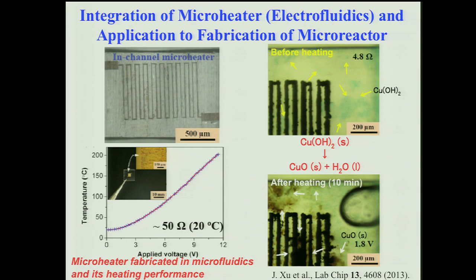Then this technique was applied to fabricate a micro reactor by integrating the microheater into the glass microfluidics like this. And this integrated biochip can control the temperature of the liquid sample in the microfluidics. Then the chemical reaction in the microfluidics can be greatly enhanced.